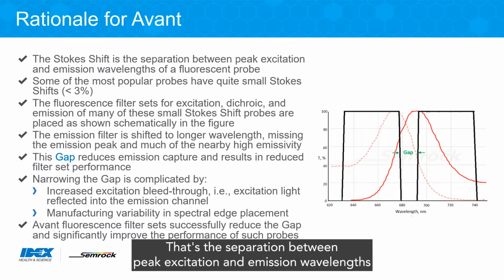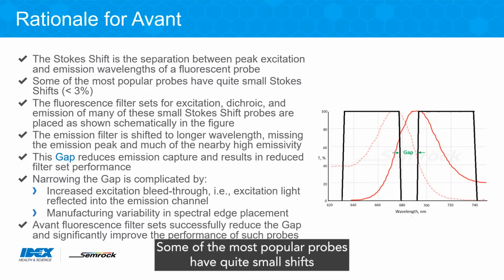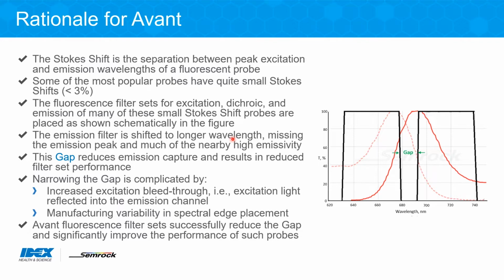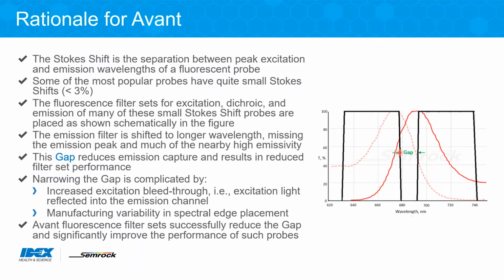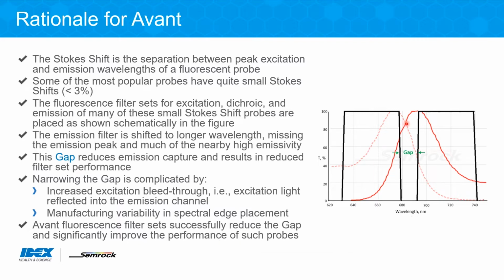We start with the Stokes shift. That's the separation between peak excitation and emission wavelengths for a probe. Some of the most popular probes have quite small shifts, less than 3% of the wavelength range. It is the case that for many of these small Stokes shift probes, the gap between the proximate edges, excitation to emission, as shown here, is placed asymmetrically with respect to the crossover point.